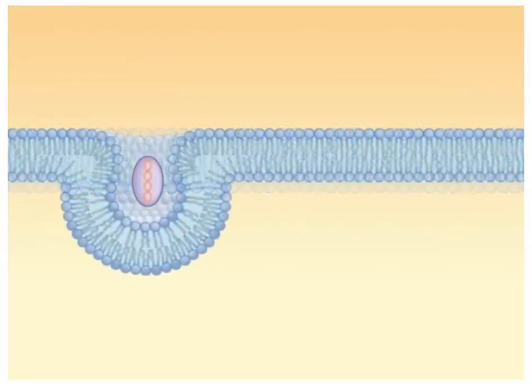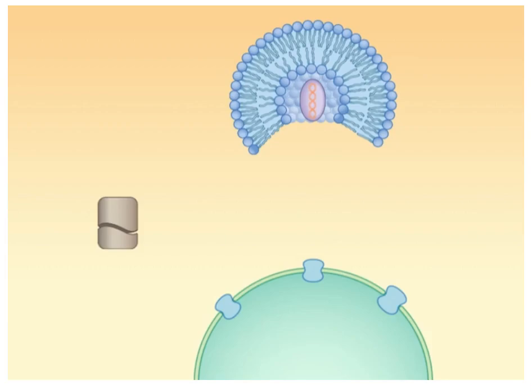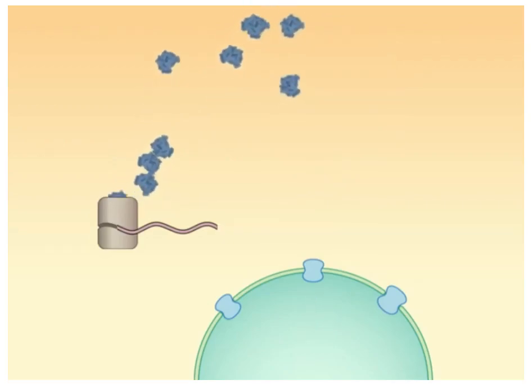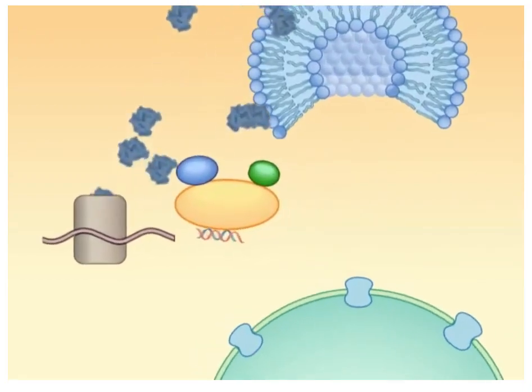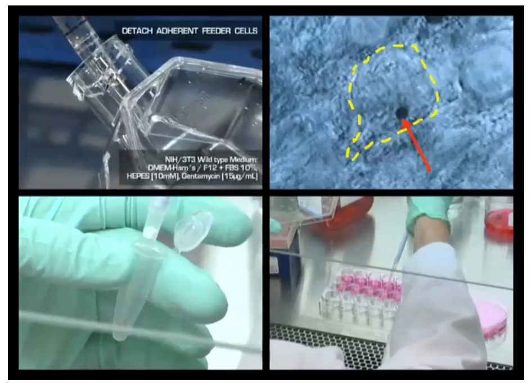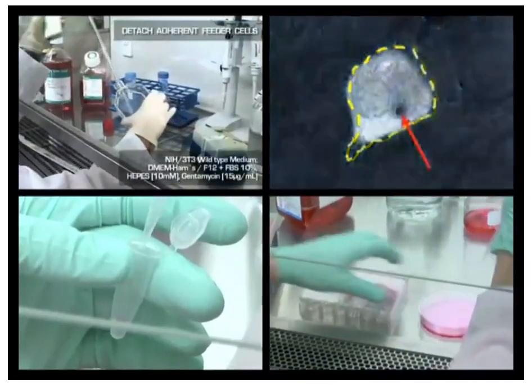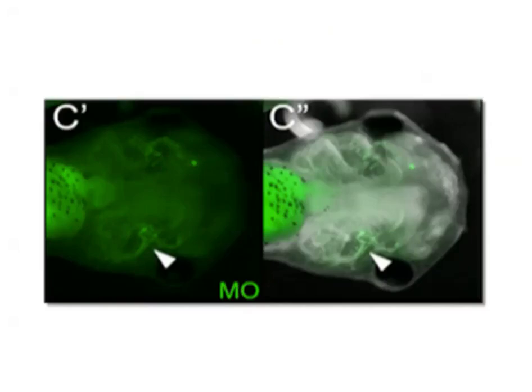Transfection is the process of inserting genetic material, such as DNA and double-stranded RNA, into mammalian cells. The insertion of DNA enables the expression or production of proteins using the cell's own machinery, whereas insertion of double-stranded RNA is used to shut down the production of a specific protein by stopping translation. This powerful tool has allowed researchers to better study gene function and expression, protein function, and genetic mutations.